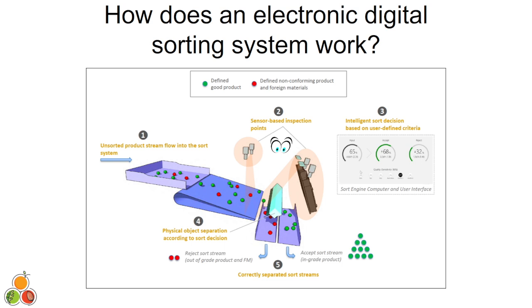3, there has to be a computer. There has to be an algorithm that we've trained beforehand to determine what those measurements are telling us. This is an apple that has a spot in the surface, whatever. We've trained them to do this. So it's very exhaustive. You need to present the piece of equipment or the sensor or the sorting system with all this information for it to be able to make those decisions.